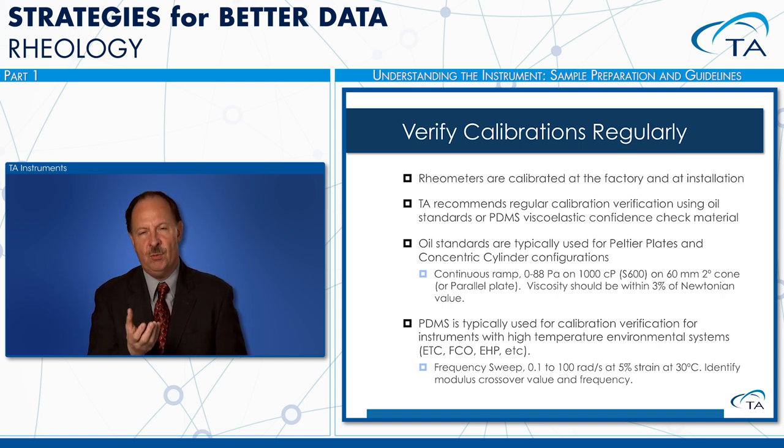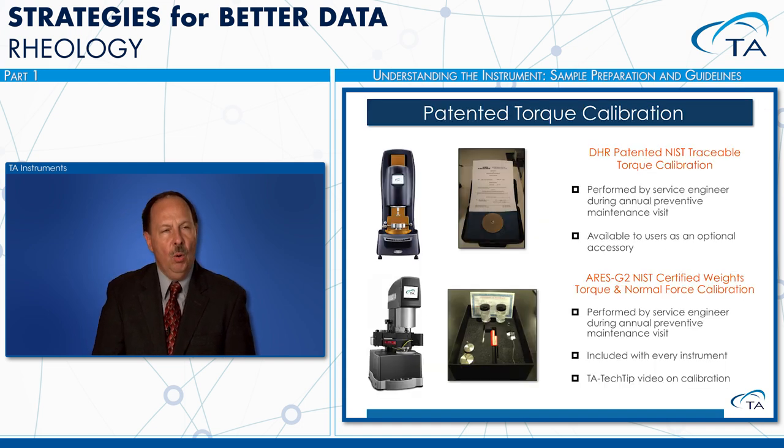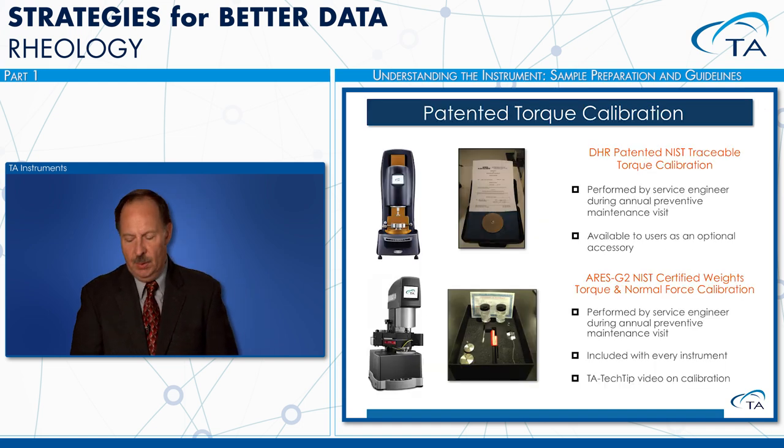And if you purchase that from us, we will give you the two parameters. We'll give you a crossover modulus, and we will describe those things later, and the crossover frequency and the acceptable range. So run that on a regular basis to make sure that the rheometer is performing as it should be.